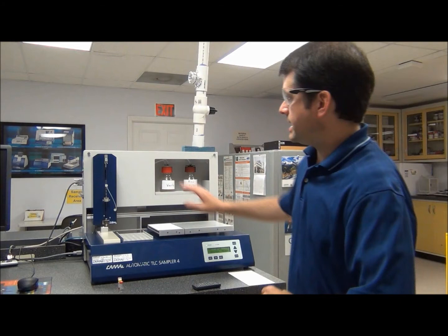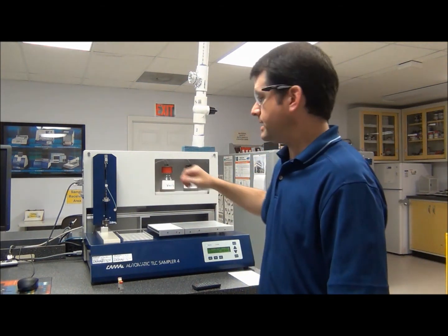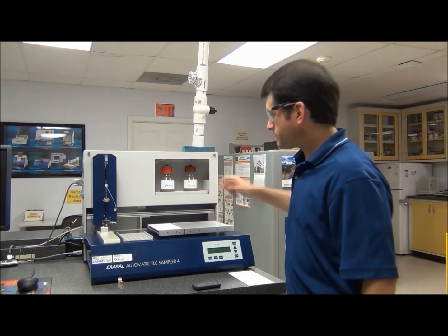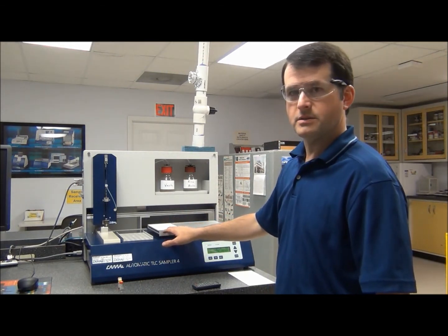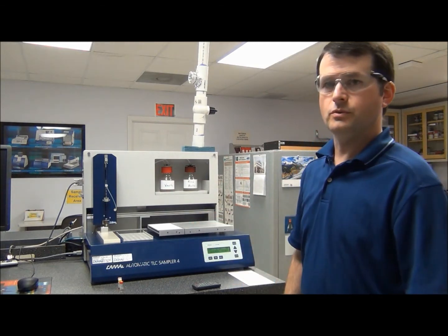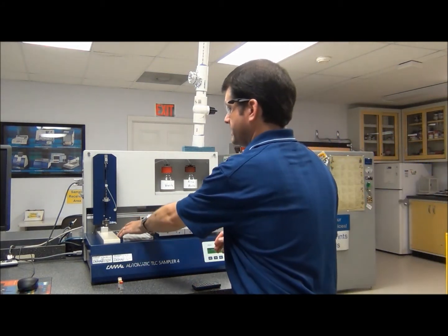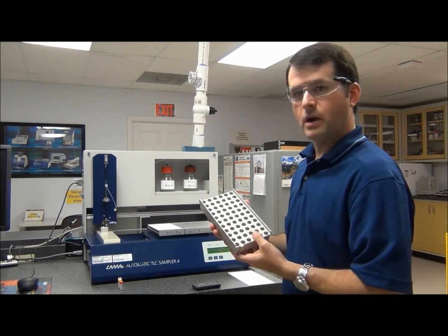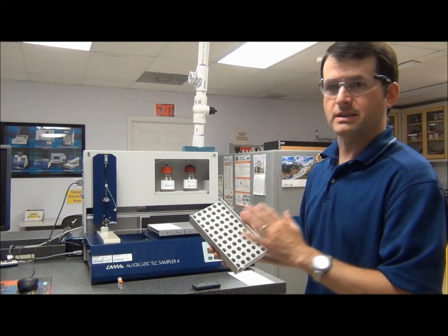The basic setup here is there's a tower which has the syringe and the needle, where the sample will be drawn up and then sprayed. There's a rinsing bottle back here that has methanol in it, and then there's a waste bottle here as well. There's a stage platform, and the small plate you see here is a waste plate that remains on the instrument. Then there's an area for your HP TLC plate, which accommodates up to 20 by 20 centimeter size plates, but we're using a 20 by 10. Finally, there's a sample rack with a grid pattern, where your sample vials go, and you can tell the software exactly where you put each vial.